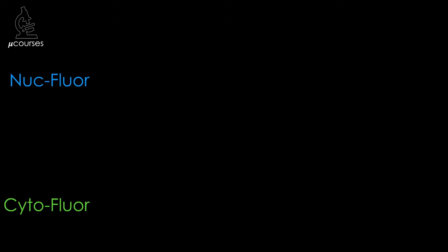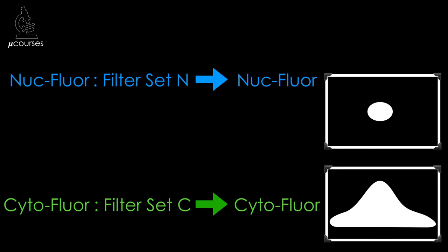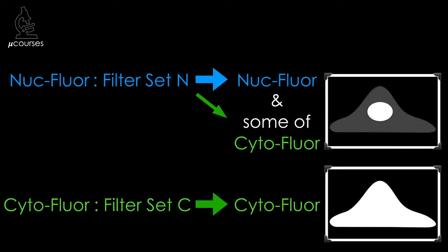We're going to examine bleed-through that occurs in our example specimen, in which fluorescence from cytoflor is collected when acquiring images with filter set N. In this example, all is fine when we image cytoflor with filter set C — the image contains only signal from cytoflor. However, when we image nukeflor with filter set N, we detect not only nukeflor but also bleed-through from cytoflor. If we were to then label these images as nukeflor and cytoflor, we would be wrong.